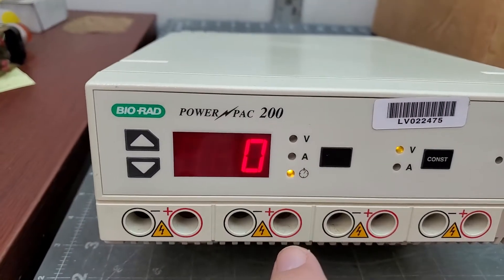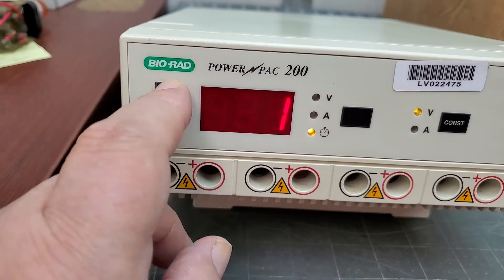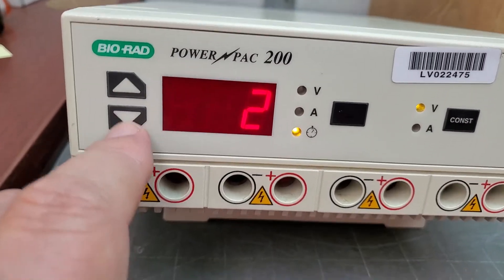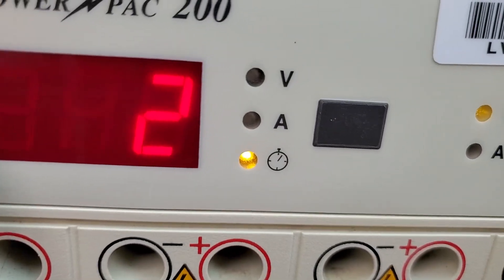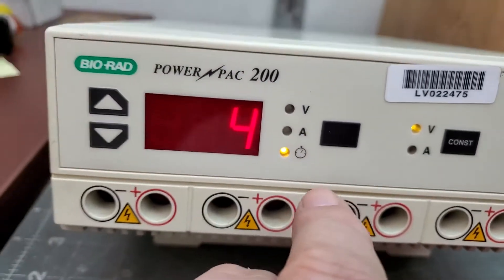That one, I don't know what that thing means. That looks like a timer, like a clock or something. All right, that's a timer.